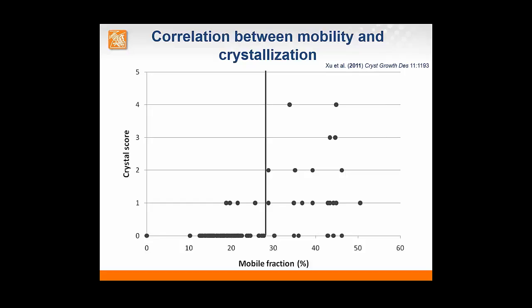And then we waited for another 7 days and looked at the fluorescent images for appearance of crystals. And then we scored crystals by using a score from 0 to 4, where 0 was no crystals, 1 was a shower of very tiny crystals, and 2, 3, and 4 were crystals with increasing size.